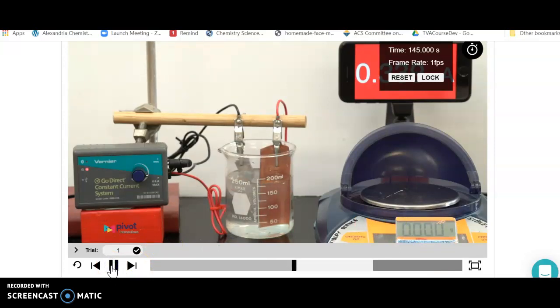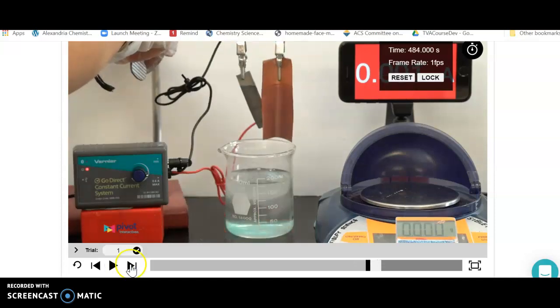You're just going to keep running this until the experiment is done. The experiment is done when they're going to stop and take these two pieces of metal out of the sulfuric acid. We've got to keep track of the time in which this occurs.